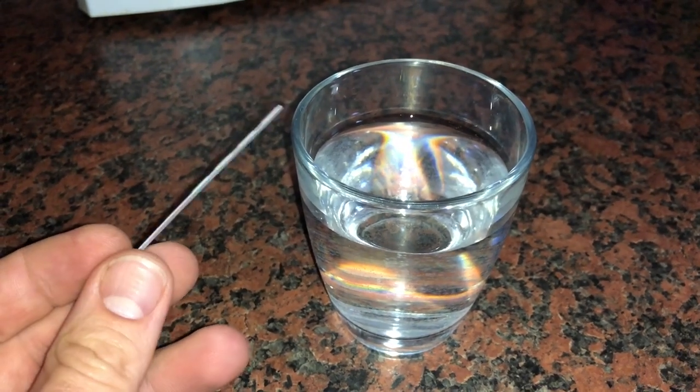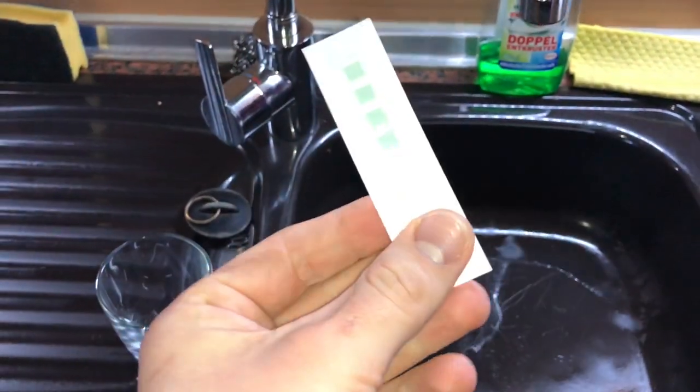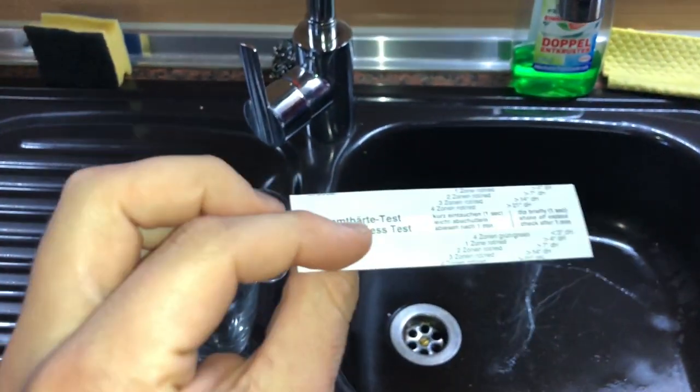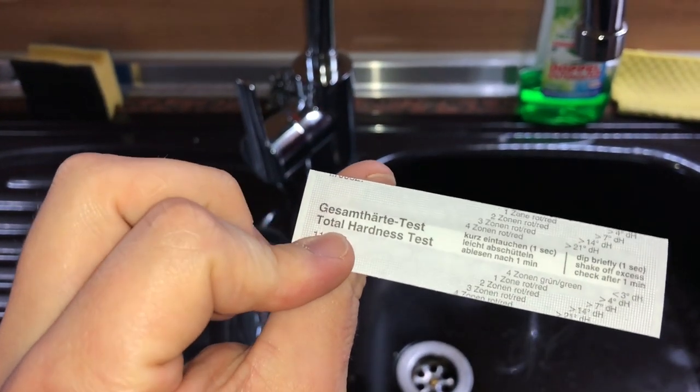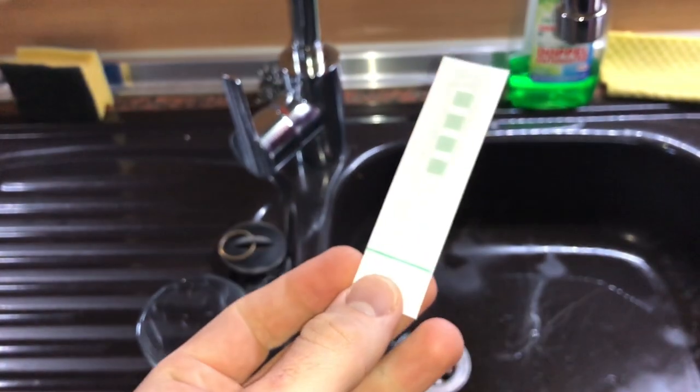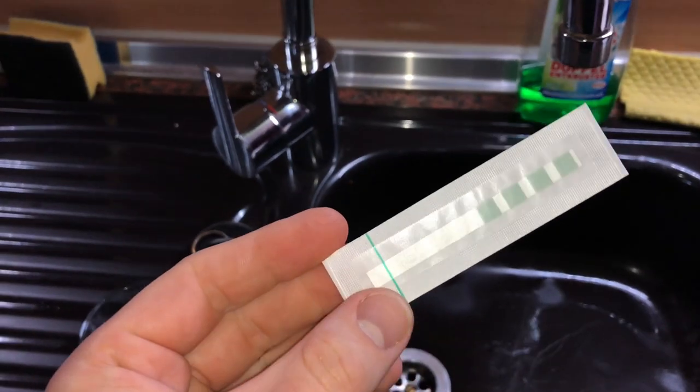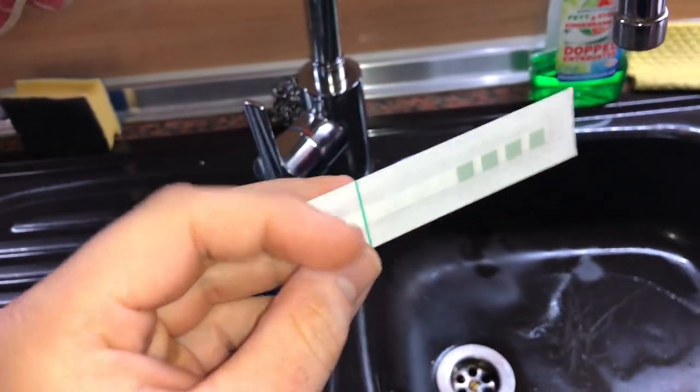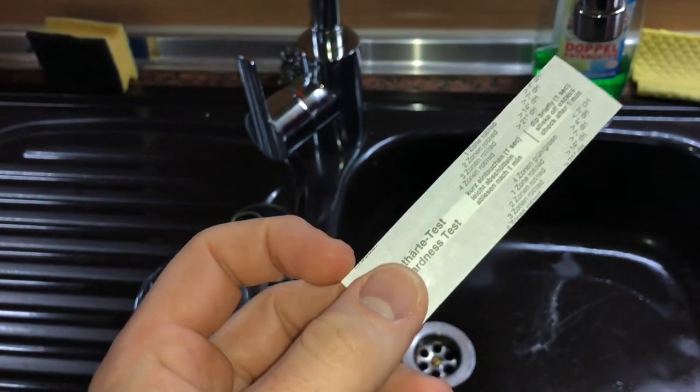There it is, the water stick in my hand. Remove the total hardness test out of the package because this is wrapped with some paper.